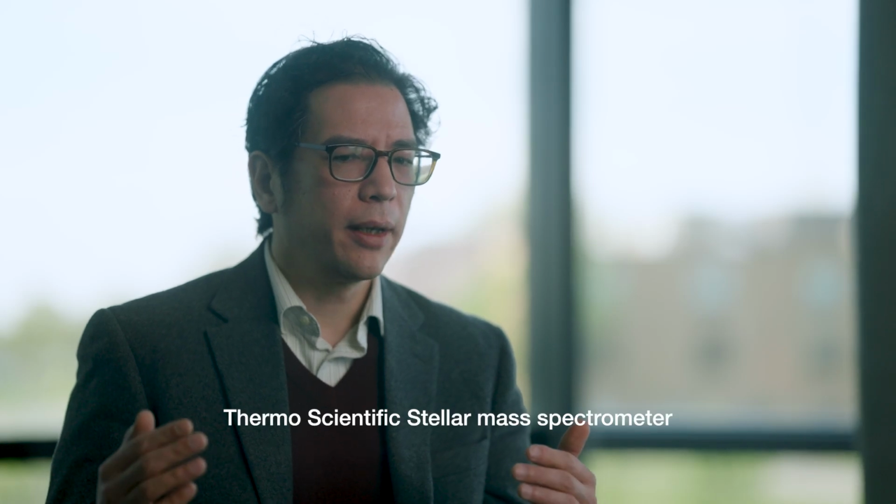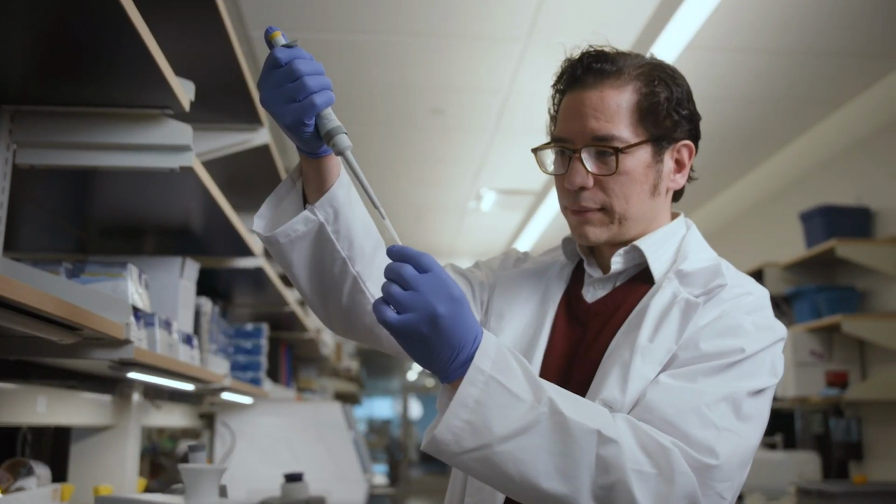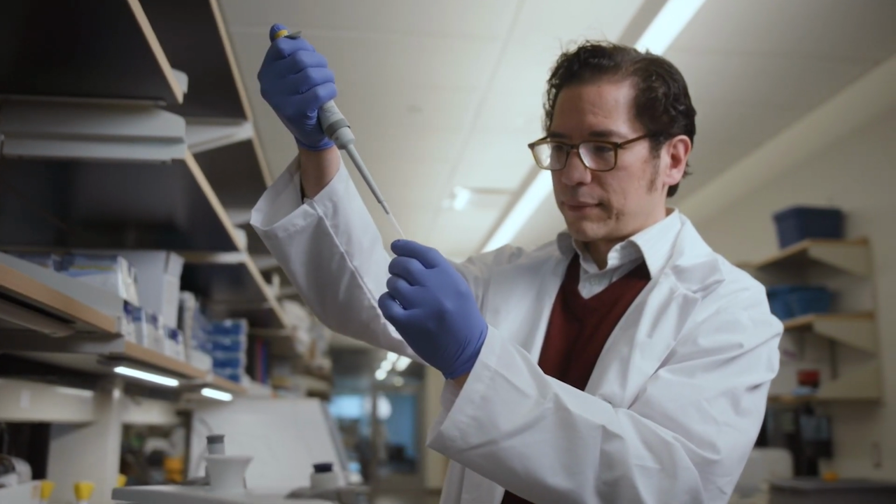So before using the Stellar mass spectrometer, we were using an Exploris 480 for this type of experiment. This is an extremely specific instrument that's able to make very precise measurements with very high mass accuracy and high dynamic range. But we have to take a lot longer to make any individual measurement, and we have to use a lot more sample.